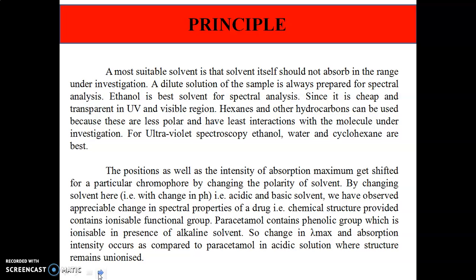Now we have to see the principle involved in the determination of the effect of solvent on paracetamol. The most suitable solvent is one that itself should not absorb in the range under investigation. A dilute solution of the sample is always prepared for spectral analysis.